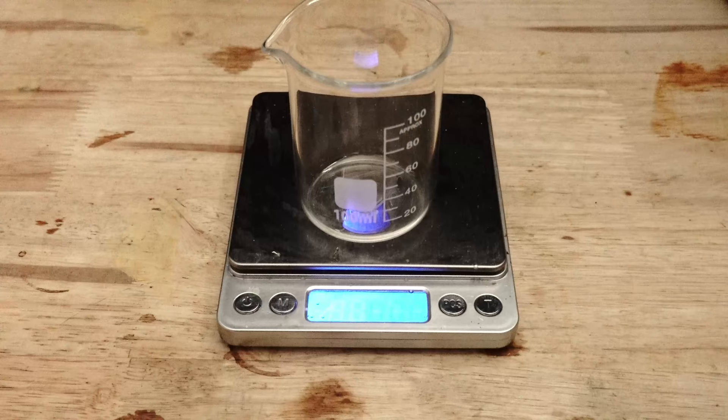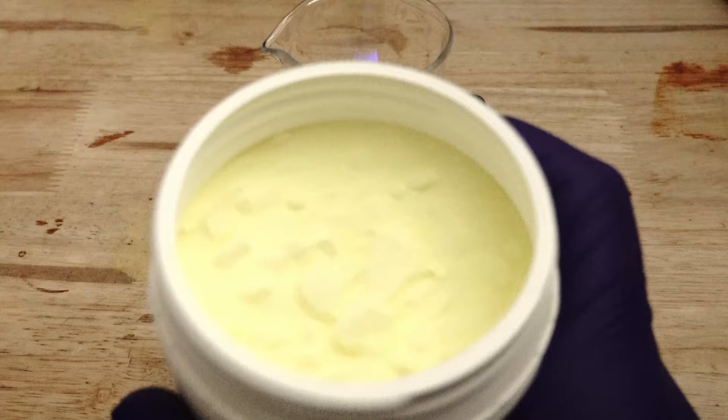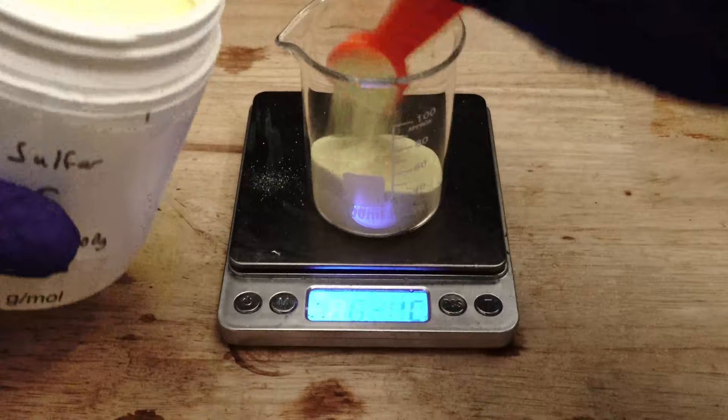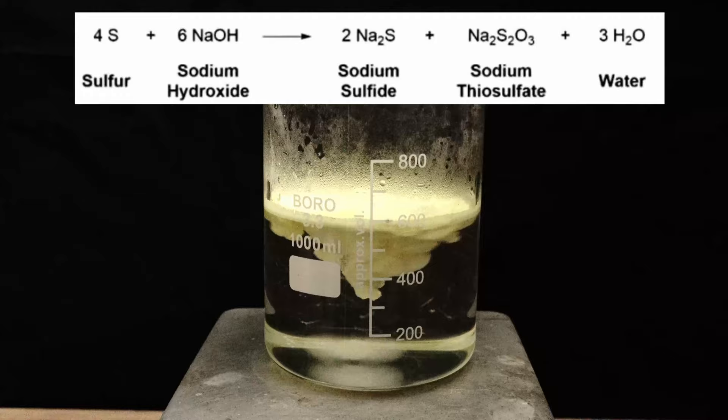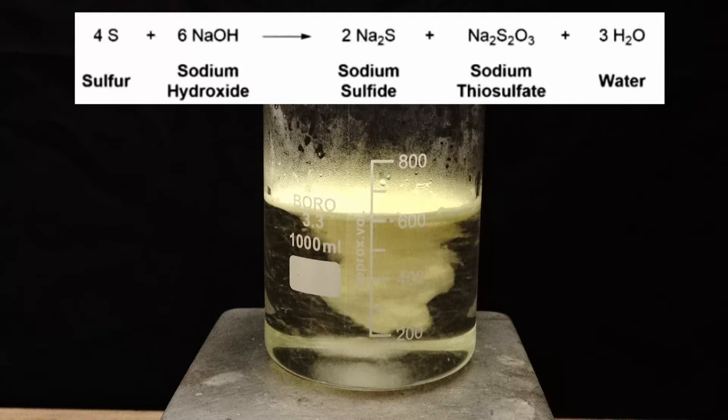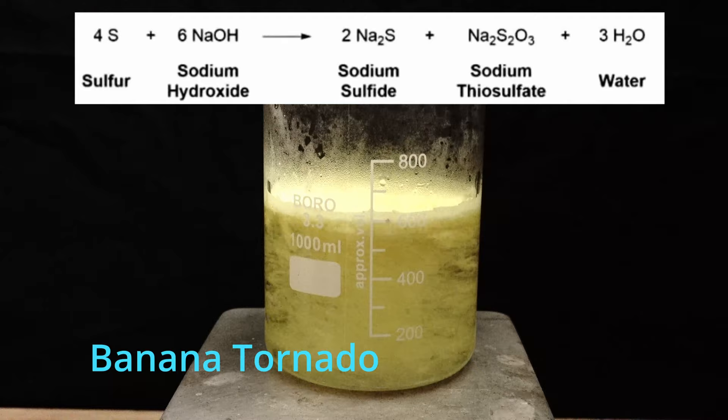I transfer this over to a larger beaker, then proceed to weigh out and add 45 grams of what I like to call banana powder, something the average Joe seems to call sulfur. It tastes great in protein shakes. Essentially, what we are creating is a sodium sulfide solution which will form a soluble complex with the mercury sulfide. This allows it to dissolve into the water, making it vulnerable to the finesse of the aluminium we will add later on.